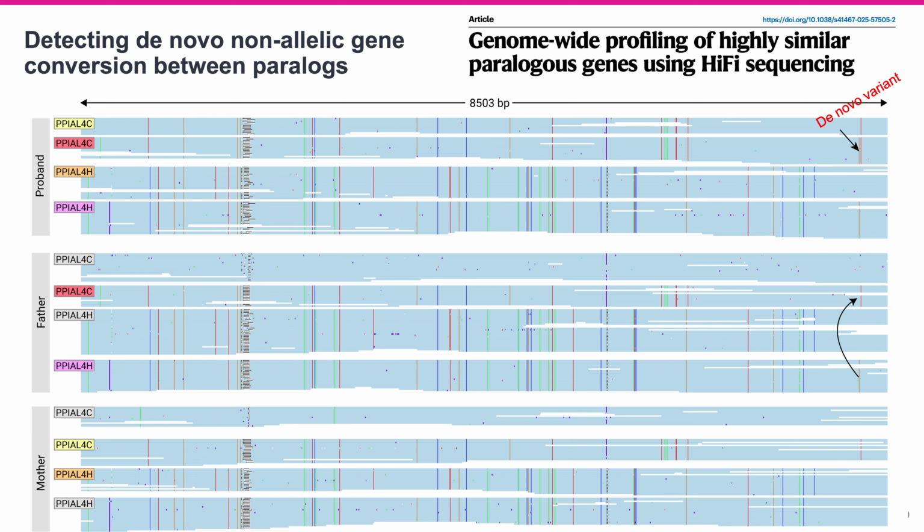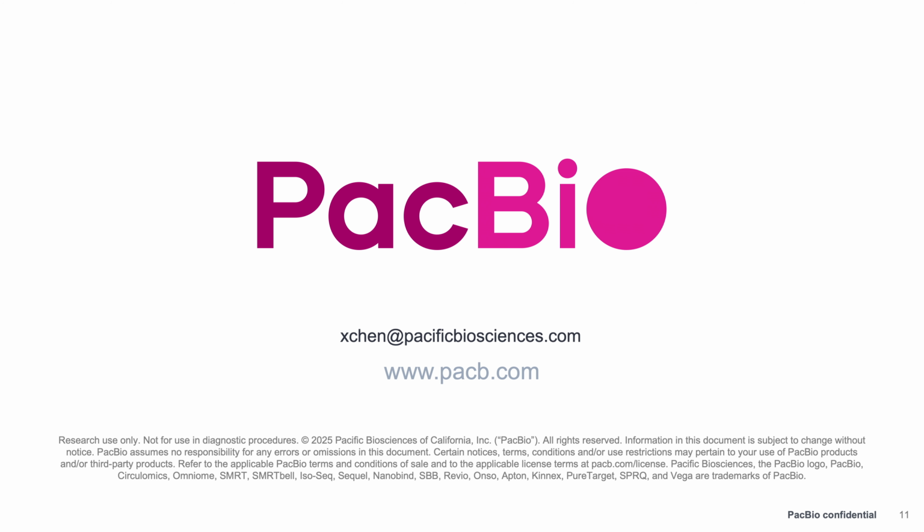This is another example of how one can use Paraphase to compare the sequences of paralogs and study the biology of segmental duplications. I hope this presentation helps you understand how one can use Paraphase to genotype highly similar paralogous genes.